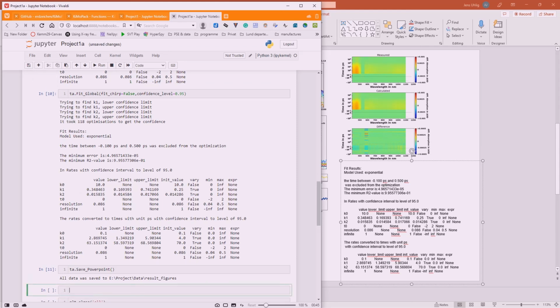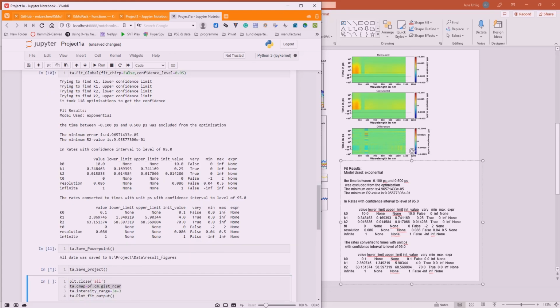Then one can open up and restart the project at the same point, by typing the function big S: save data, save plots, save PowerPoints, save project, and it is saved as an HDF5 file which contains everything. And saving of confidence just means that there is an object which was not saved, which we don't need for actually reporting.